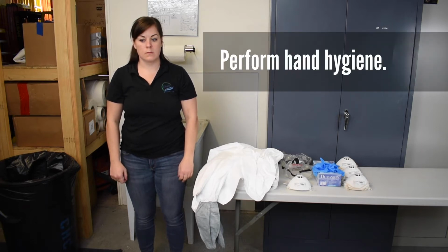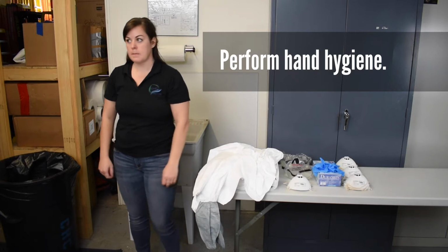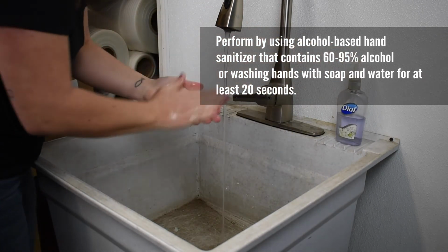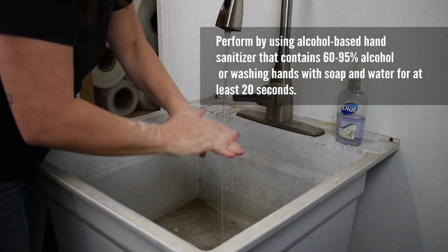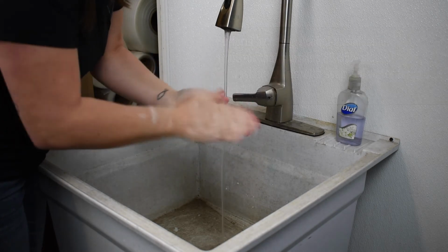The next step is to perform hand hygiene. Hand hygiene should be performed by using alcohol-based hand sanitizer that contains 60 to 95% alcohol, or washing hands with soap and water for at least 20 seconds. If hands are visibly soiled, soap and water should be used before returning to alcohol-based hand sanitizer.